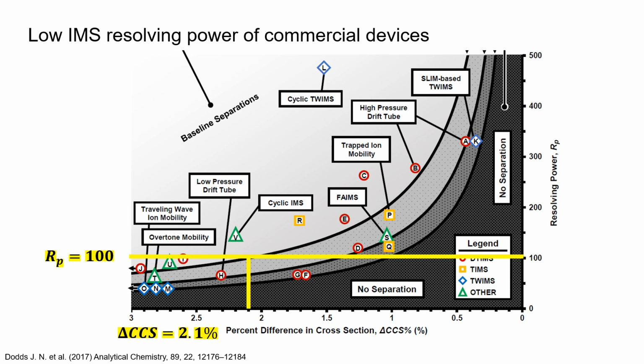And this problem does not affect the traveling wave technology, where a modest wave voltage is applied between electrodes, like 40 or 60 volts, which is moving at the wave velocity. This means that in traveling wave, we can have a longer device without the need for incredibly high potential difference between the beginning and the end of a drift cell.